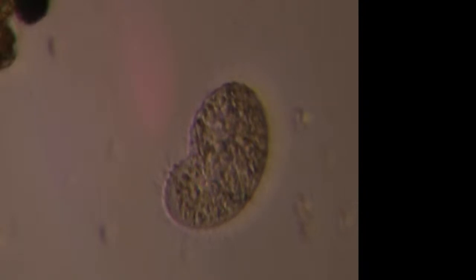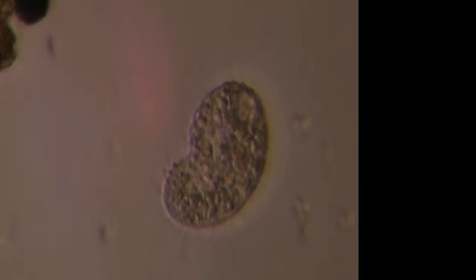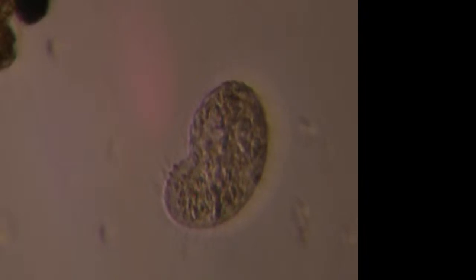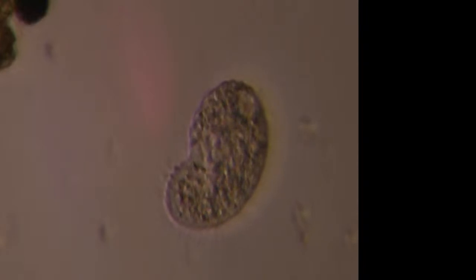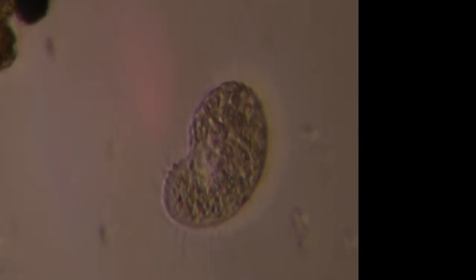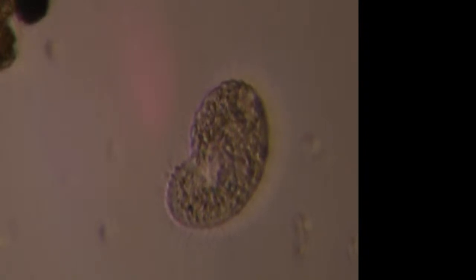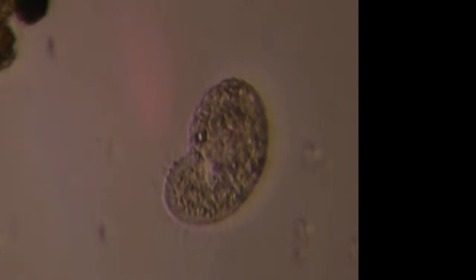But there's some protozoans that actually nibble on other ones to get the contents. And some of these bigger ones, like stentors, can actually be injured, spill out a bunch of contents, but heal and swim away, maybe half or a third the size they were, but they're just okay. They just healed themselves, but the stuff they left behind is being eaten by the guy that made the hole. It's kind of bizarre. It's almost like some parasites that we can get that bite into our skin and suck out the juices and such.